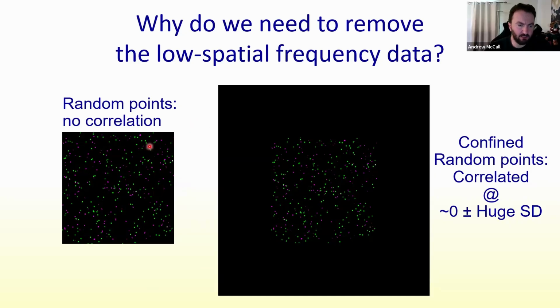If we were to analyze an image of just random points, and we had basically a process to randomize the points and analyze it over and over again, you would eventually find that there's no correlation, or at least no consistent correlation over iterations, right? However, if we do the same process, but instead we add a black background around that image before we analyze it, and we're analyzing the whole region, you will find that there is a spatial correlation over distance.